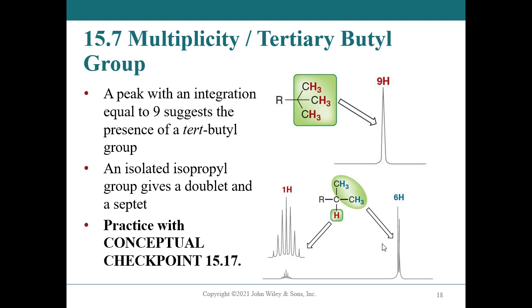You get diastereotopic methyl groups. So when you look at that spectrum, don't let that throw you. And now you know the reason why as well. But students often look at that and it's like, why do I have two methyl groups? It's because they're diastereotopic.